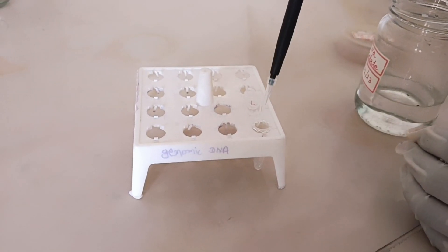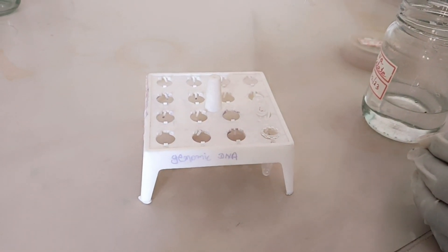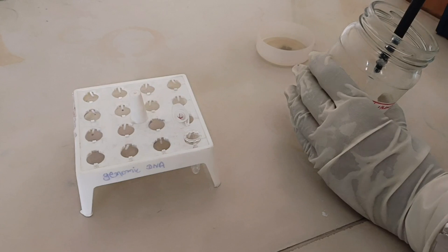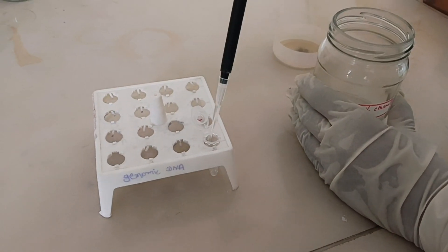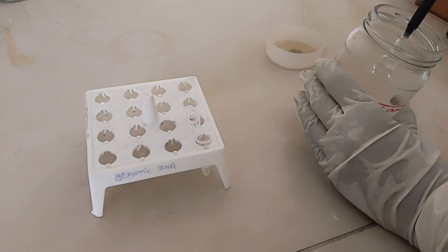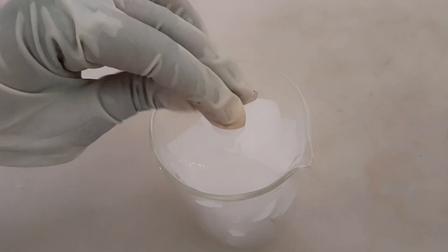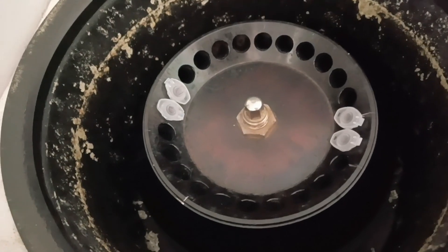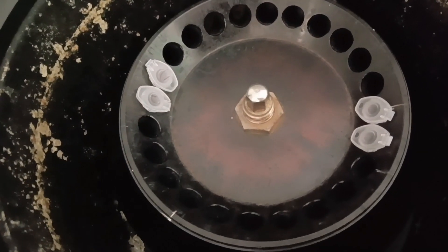Add 0.1 volume of sodium acetate. Add 2.5 volume of 100% ice-cold ethanol. Put the tubes on ice for 15 to 20 minutes. Centrifuge the tubes at 10,000 rpm for 10 minutes.